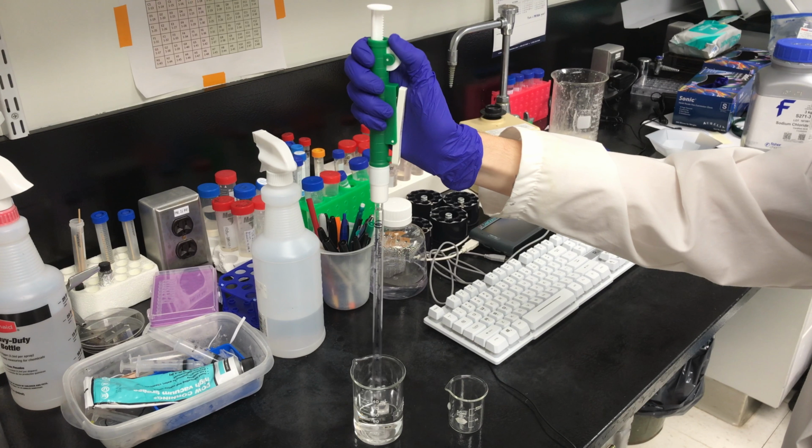She rolls it more than what she would need, so water can be drawn into the serological pipette, much like using a straw. An internal piece of the pipette pump that has ridges on the side is connected to the thumb wheel, so when the thumb wheel is rolled, it starts to poke out the top of the pipette pump.